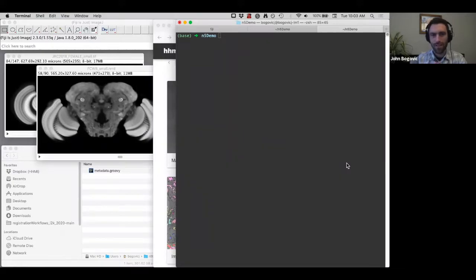But like I said, I'm happy to go into that to some degree today if it's interesting, but that is also available on Monday if needed. So does anyone specifically want some background before I start the demonstration? I know some people here are definitely familiar with this.